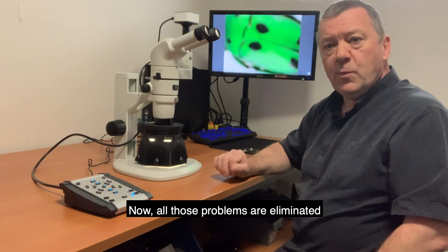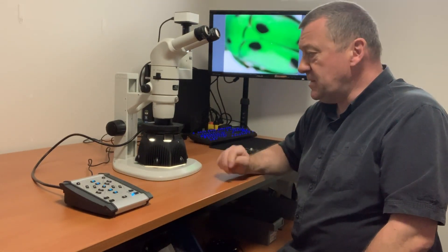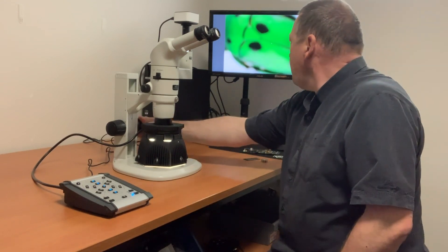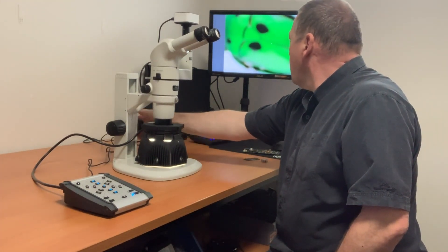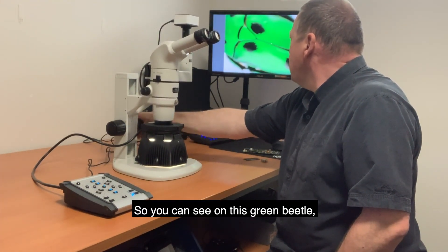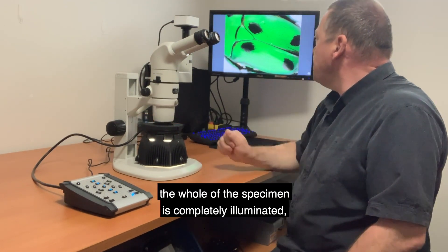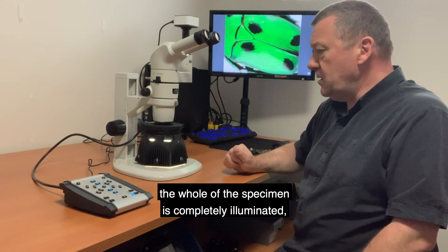All those problems are eliminated using this illumination system. You can see on this green beetle, the whole of the specimen is completely illuminated.